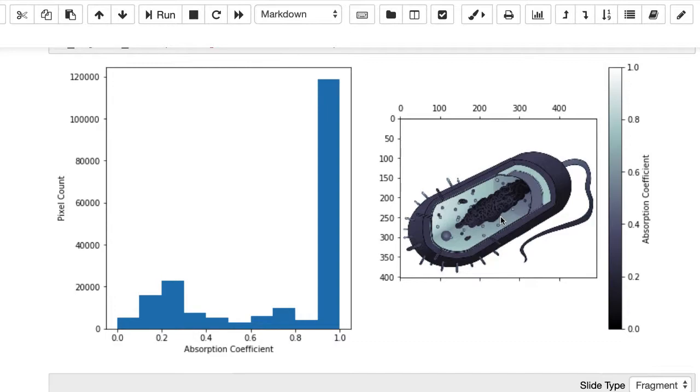When you throw it in an algorithm and it says it has 25 cilia, it's very easy to blindly trust those results and say, okay, it said 25, therefore that must be right. With qualitative analysis and sanity checks, you're able to look at very complicated structures and see what makes sense in this image and what doesn't, and come to very reasonable conclusions.